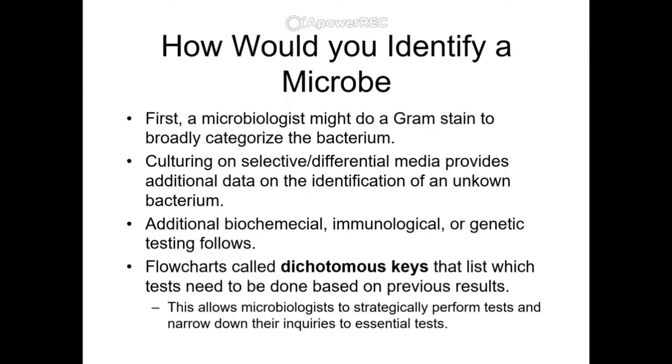If you were to imagine that you worked in a laboratory and you were given a sample from a patient and your job was to identify a microbe, how would you go about doing this? Well, naturally you would want to perform a series of tests in order to try and see what sort of chemical and metabolic and physiological properties exist with this organism.